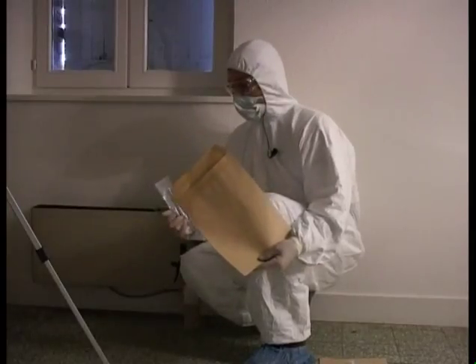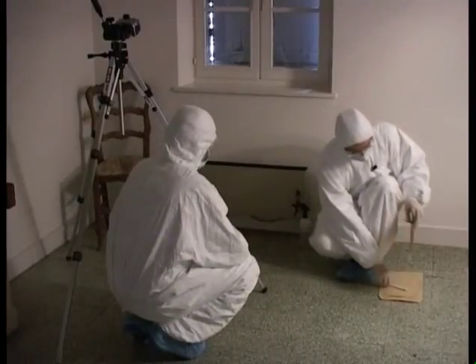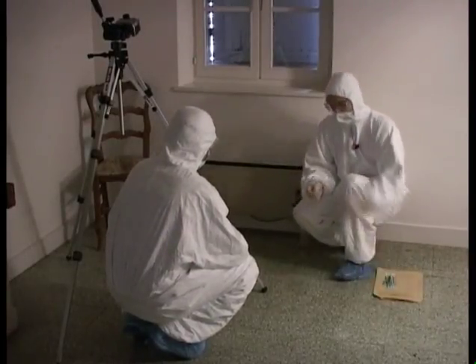In this case, the reaction took place on a tile, so it's very difficult to remove the medium. We will move on to the second method.